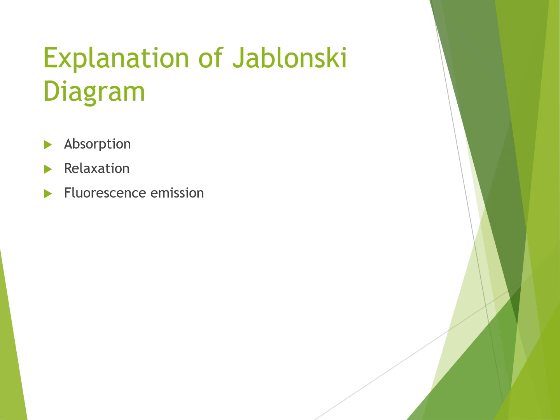As we discussed, excitation wavelength and emission wavelength will be different, as the excited molecule takes different energy, and after going through vibrational relaxation and internal conversion, the fluorescence emission wavelength will be different.